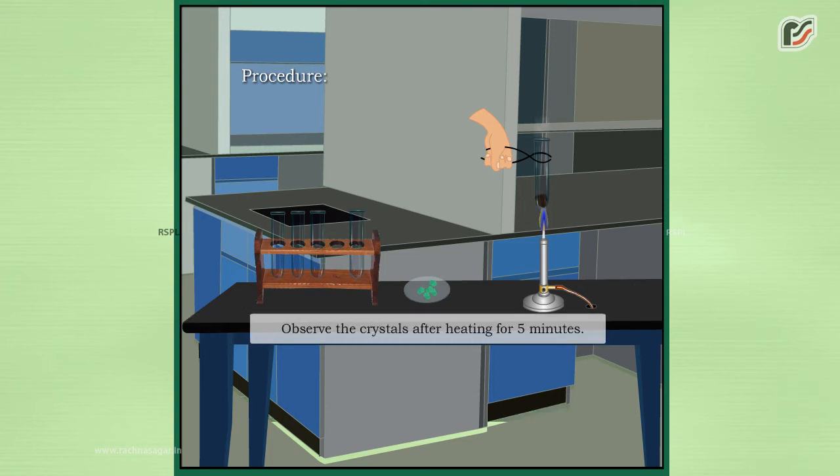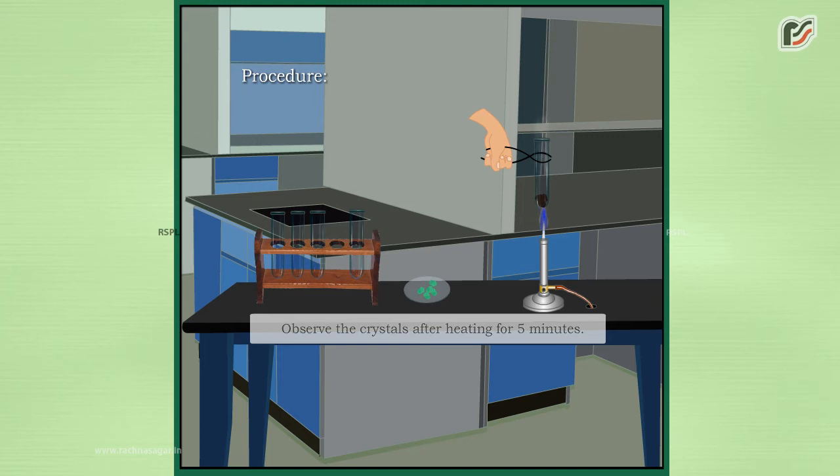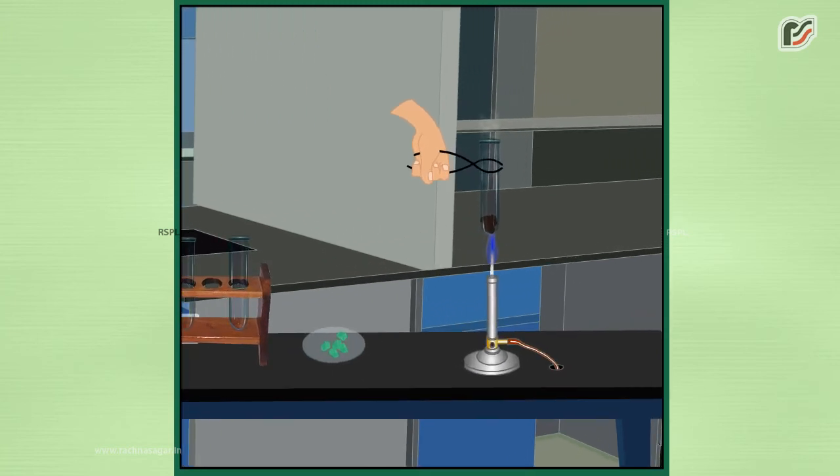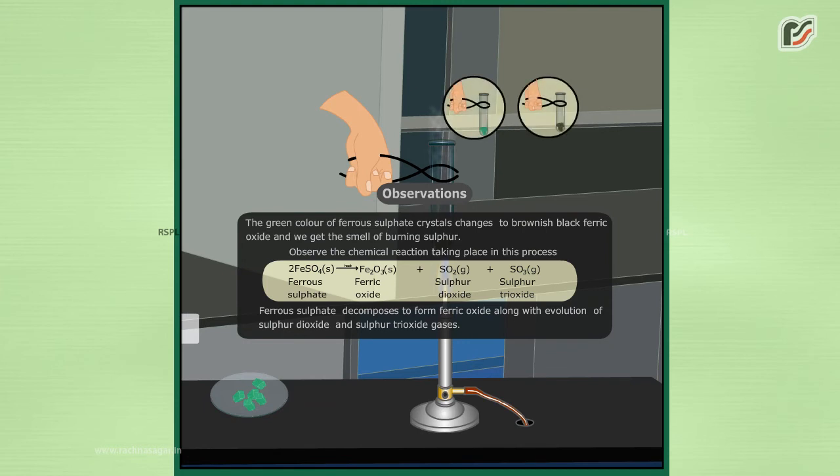Observe the crystals after heating for 5 minutes. Observation: The green colour of ferrous sulphate crystals changes to brownish black ferric oxide, and we get the smell of burning sulphur.